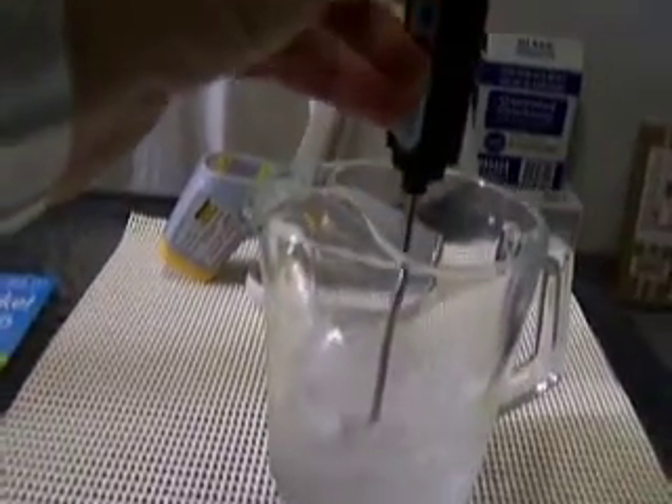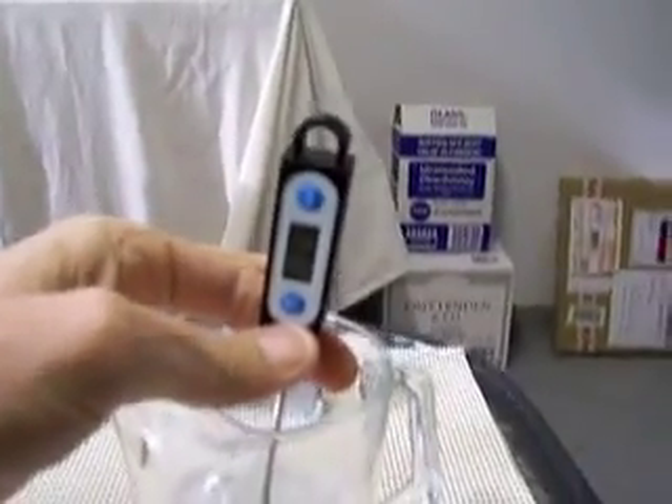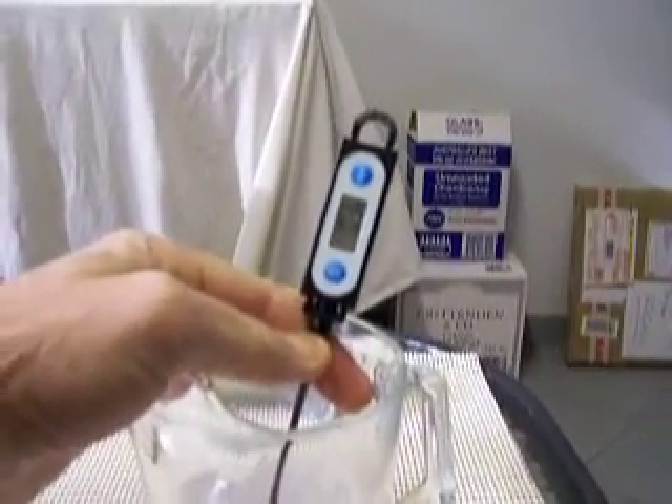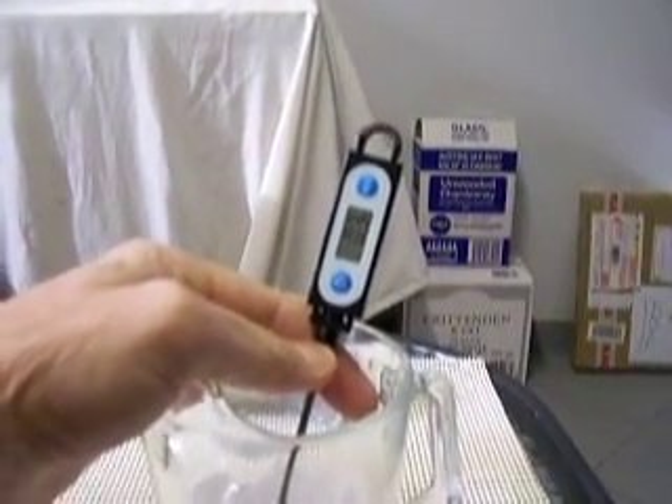Have a look at this unit here — it's indicating 0.3 of a degree, which is well within its accuracy tolerance of plus or minus one degree.